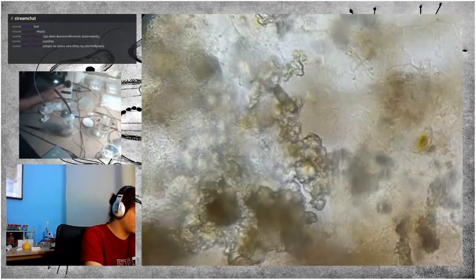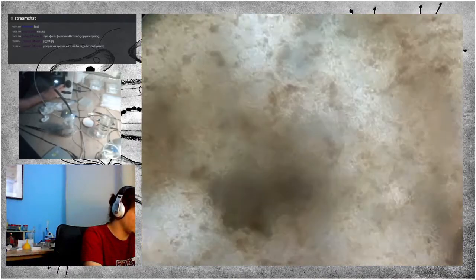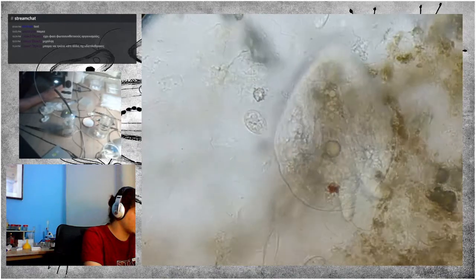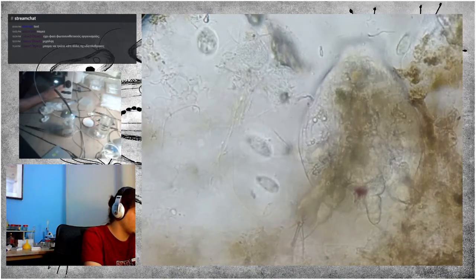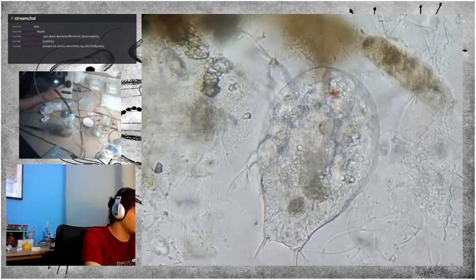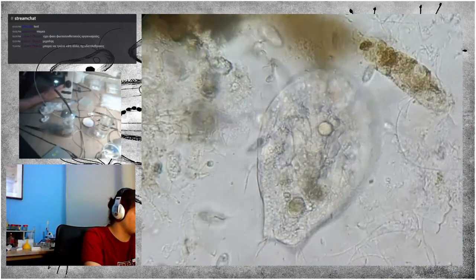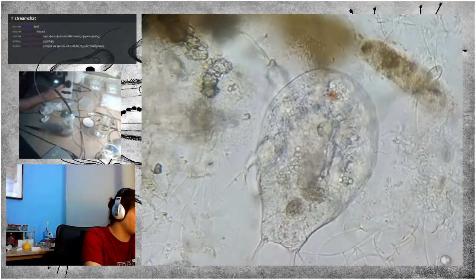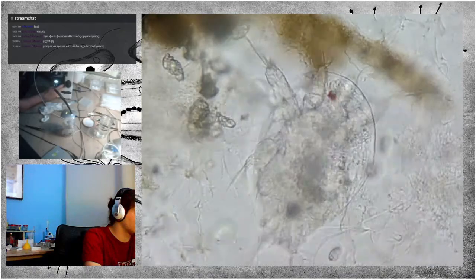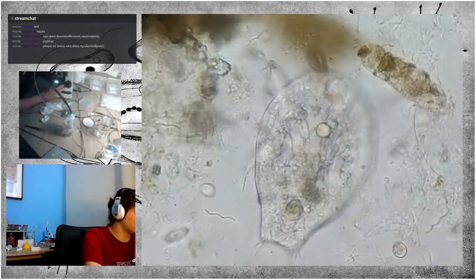The problem with the biofilm is that it generally floats, so things can easily go under it, but not necessarily over it. And the things under the biofilm are very hard to observe. Oh, I think I can just about see some individual cells. Or maybe not, I'm not sure.